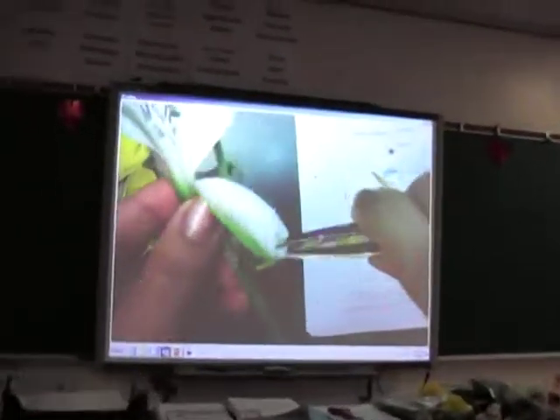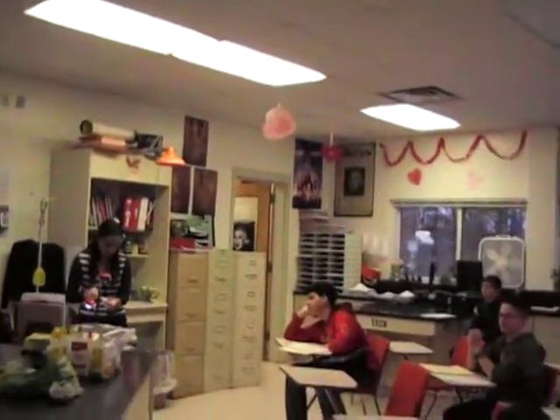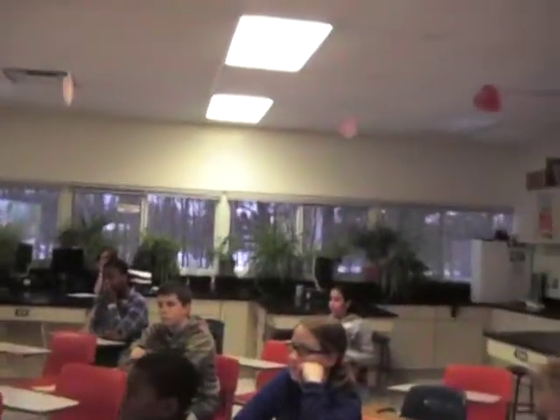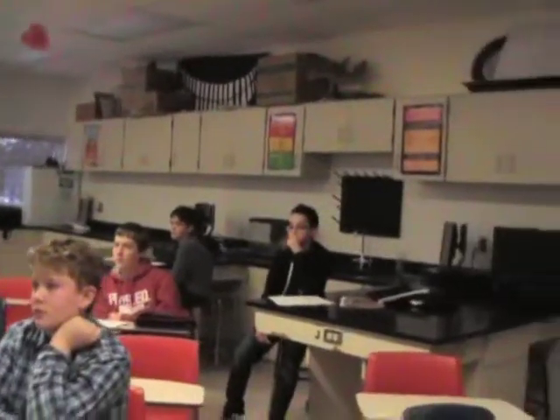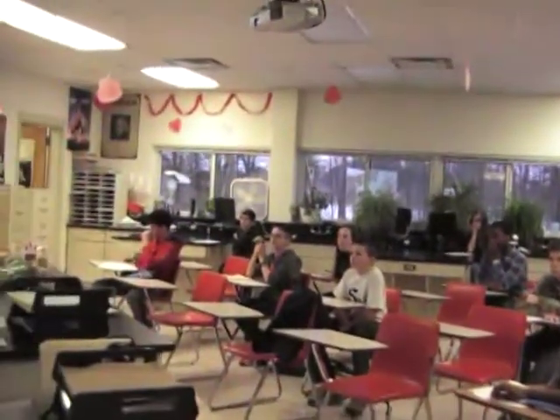Whereas in this flower, your stigma will look very different. So these are your stamen. This is your filament that I'm holding on to, that I'm latching onto right now. And this at the top is your pollen. Then your stigma looks very different. It kind of blends in with the rest because it's not the same color as the filament. So this right here would be your stigma. And it has 3 prongs also. So it looks very different.